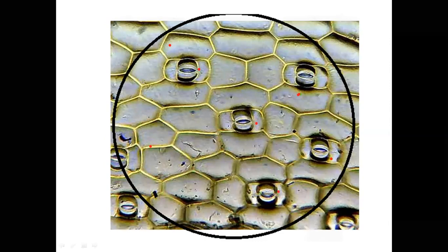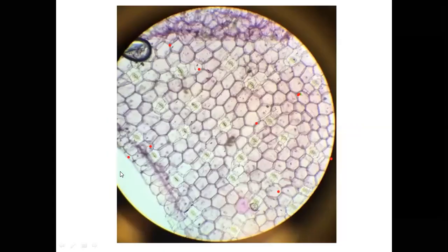Hata hii ingine tunaweza sema it is part of us. Although, yeah, 5, 6. You see, the first field of view tukapata 3. The second field of view of the same magnification, we got 6. So that now, how to fill in this table may make sense.